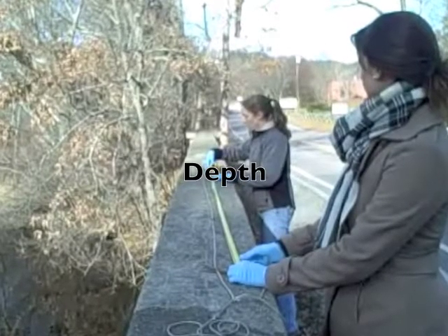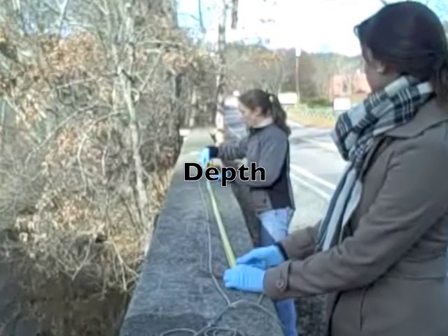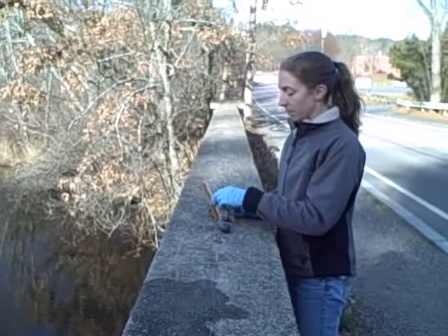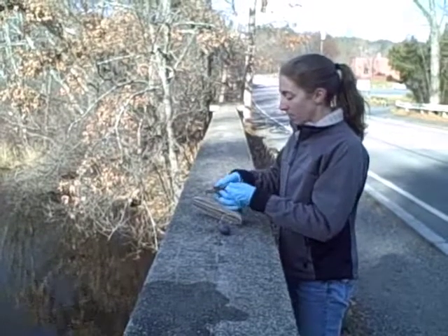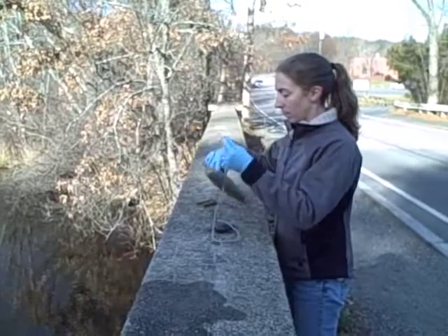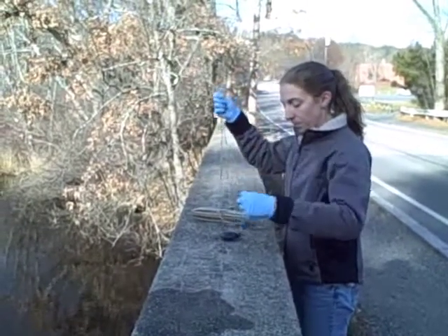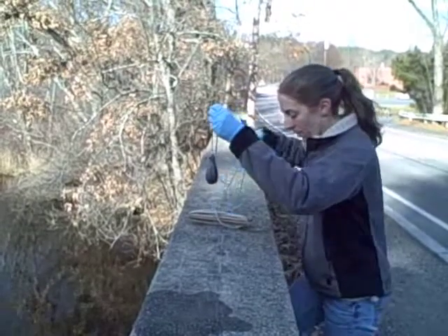While there are a few methods for measuring depth outlined in the training manual, this section will review just one of those methods. Depth measurements should be taken as close to the center of the river as possible, away from abutments and other obstructions to flow. Once a depth measuring location has been chosen for your site, be sure you and your partner are sampling at the exact same location each time.